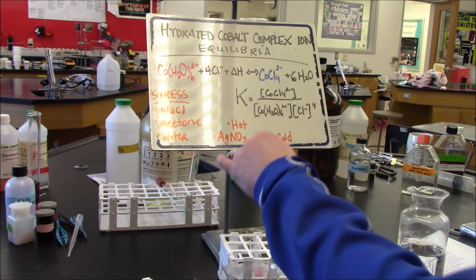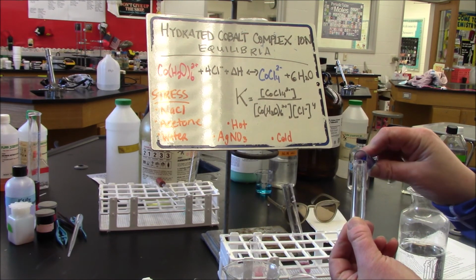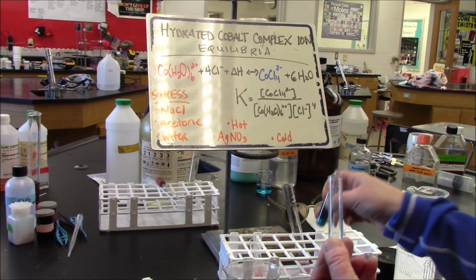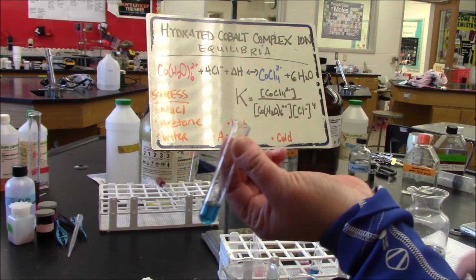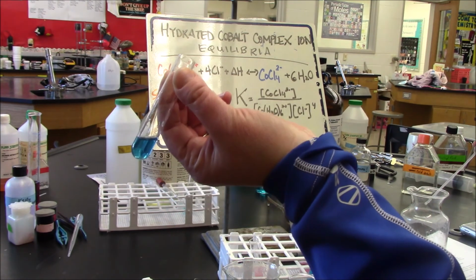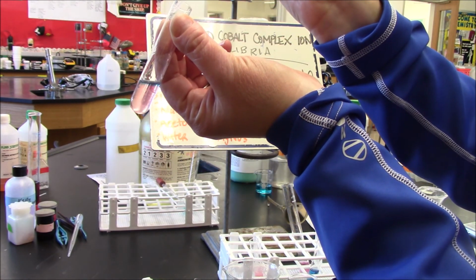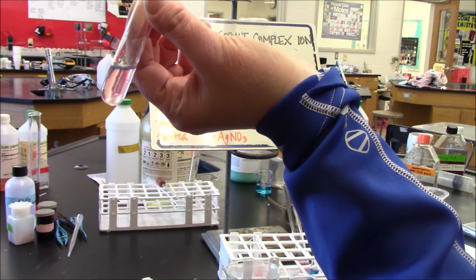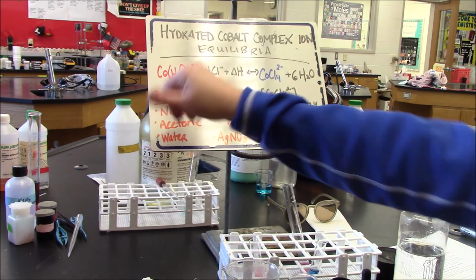All right. I think the last change that I should try is to add excess water. So I'll take a small amount and I'll add excess water. And you can see excess water causes it to go from blue to pink, from one complex ion to another.